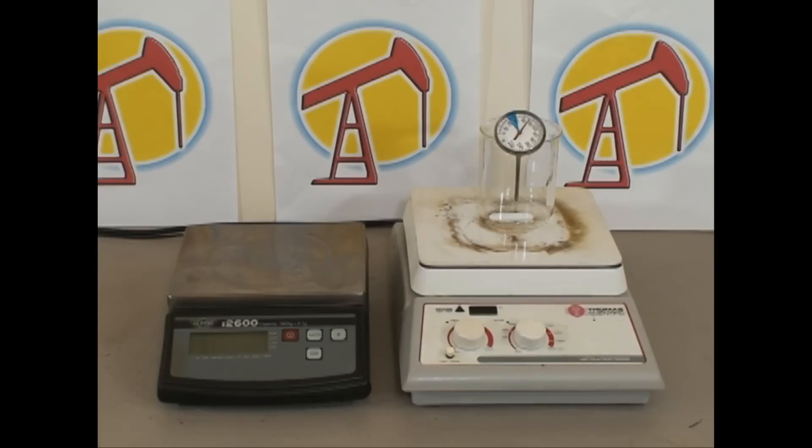On the right we have a hot plate stirrer with magnetic stirrer, a 250 milliliter beaker, and a bimetallic temperature gauge.